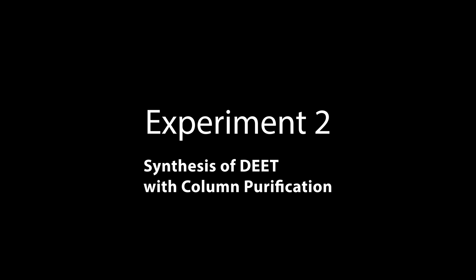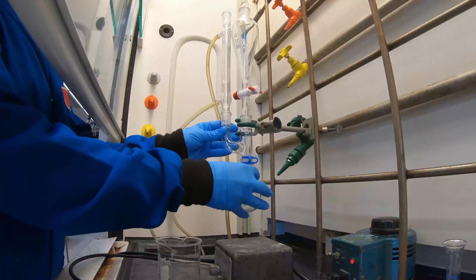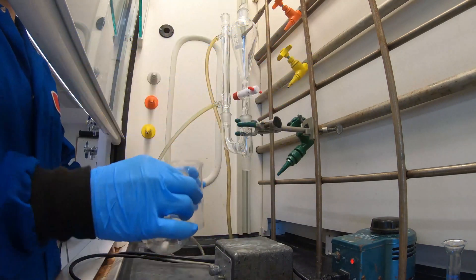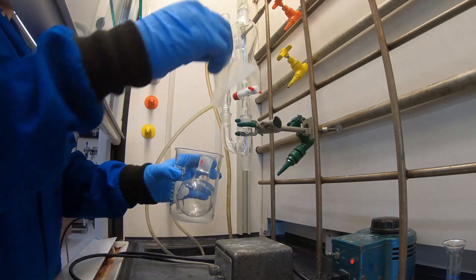Experiment two, DEET synthesis. Begin by assembling an apparatus for addition under reflux. This will include your claisen adapter, your addition separation funnel, and then your condenser.